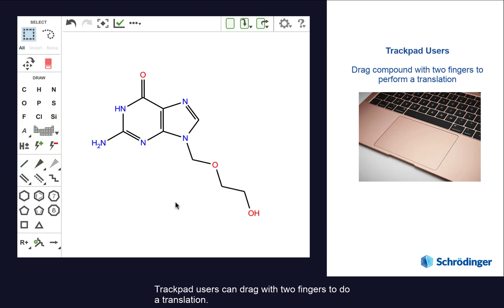Trackpad users can drag with two fingers to do the translation, and for any user, the move tool can be used to rotate the compound.